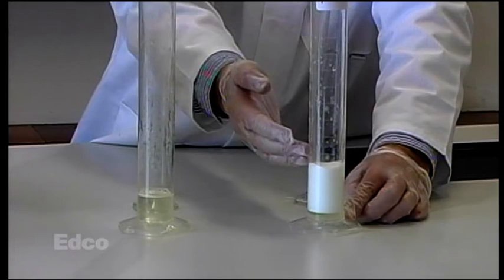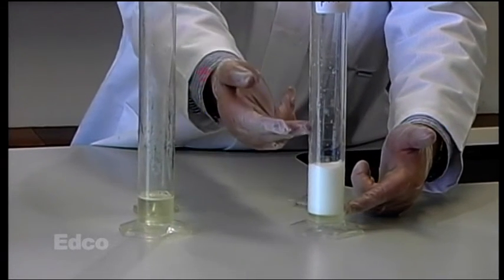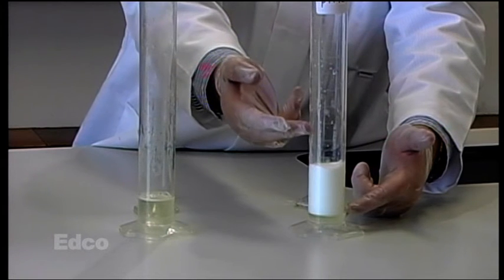We wait 2 minutes and calculate the volume of foam. Again, subtracting the volume of liquid in the bottom from the foam at the top. So 2 minutes later, we'll get our results.